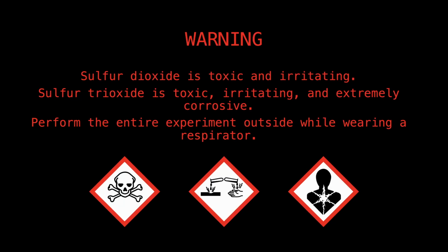Warning: sulfur dioxide is toxic and irritating. Sulfur trioxide is toxic, irritating, and extremely corrosive. Perform the entire experiment outside while wearing a respirator.